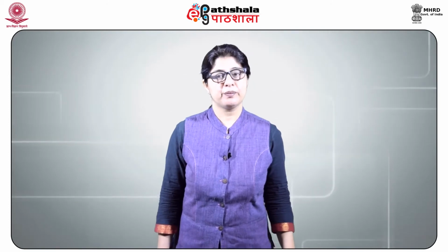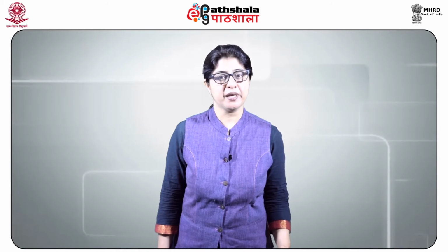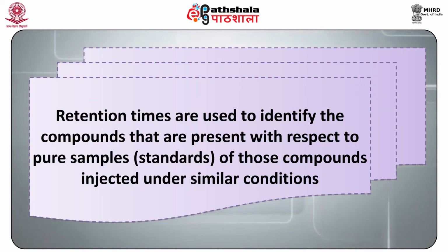The output will be recorded as a series of peaks, with each peak representing a compound in the mixture passing through the detector and absorbing UV light. The retention times are used to identify the compounds that are present with respect to pure samples, standards of those compounds injected under similar conditions.